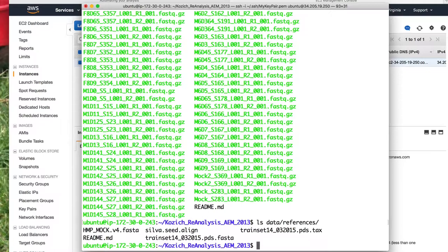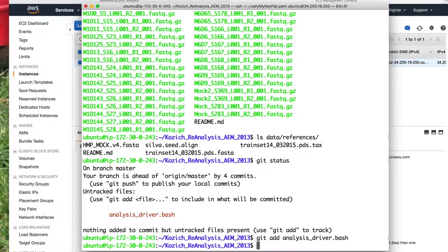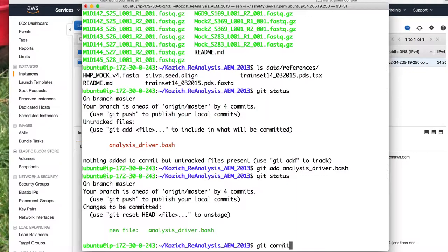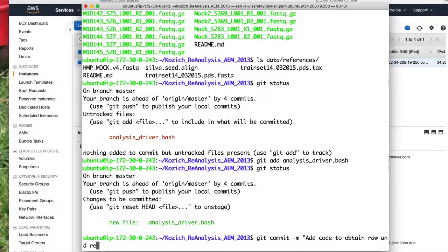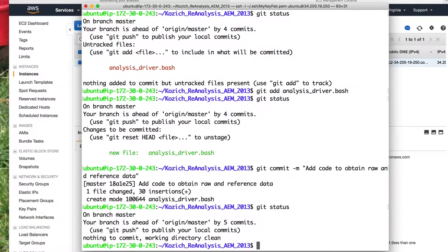So now what do we do? We need to commit. So let's do git status, git add analysis_driver.bash, git status, git commit -m 'add code to obtain raw and reference data', git status. We're good to go. It looks like previously I forgot to push — you might want to push at the end of every day you're working on your project or every couple hours, just as a backup for what you're working on.